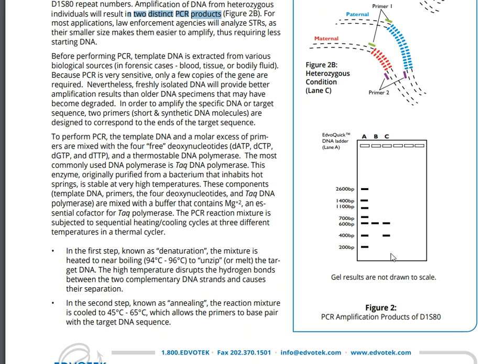All right, so in this example, here's a gel, and that gel in lane A has a DNA ladder, and that's why you see multiple bands down through the lane. Then B is someone that is homozygous for this genetic trait. So in that DNA sample, when it gets inserted and run, we see one band show up, because the band for that particular gene we're looking for is the same in the mother and in the father both. So only one band appears.